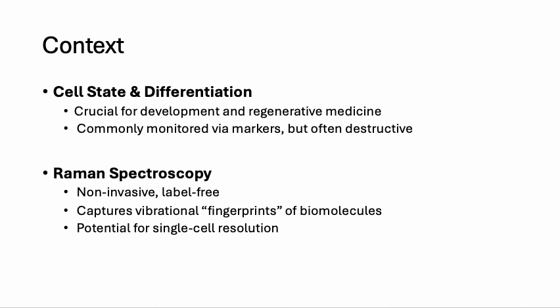It can potentially give us a single cell resolution readout of cell state without actually killing the cells. And the authors of this paper thus saw an opportunity to examine whether Raman can capture nuanced changes as the cells move from an undifferentiated state towards a specialized cell fate.